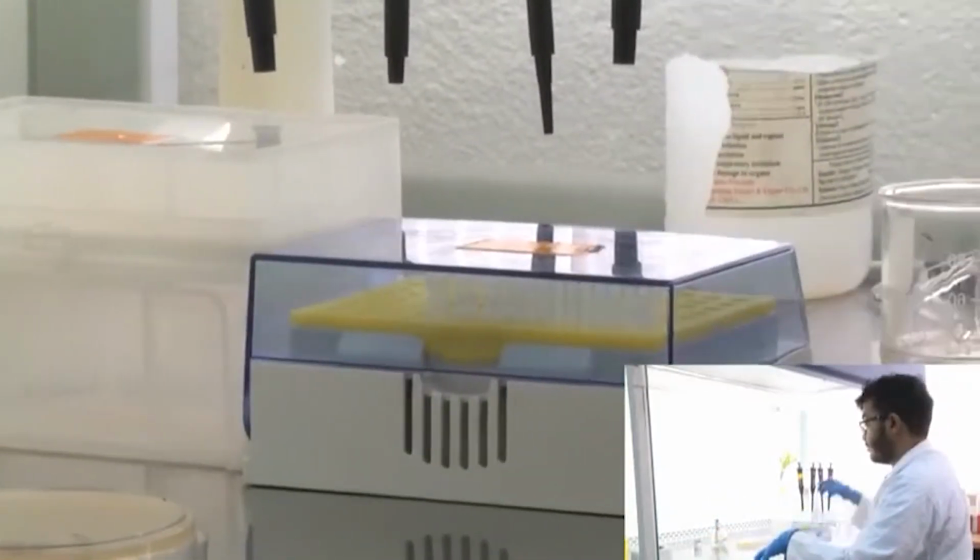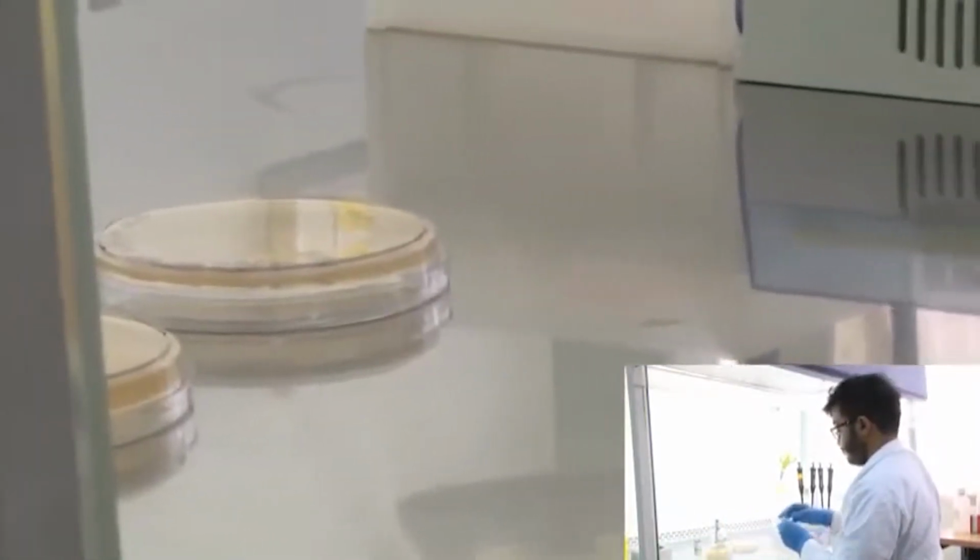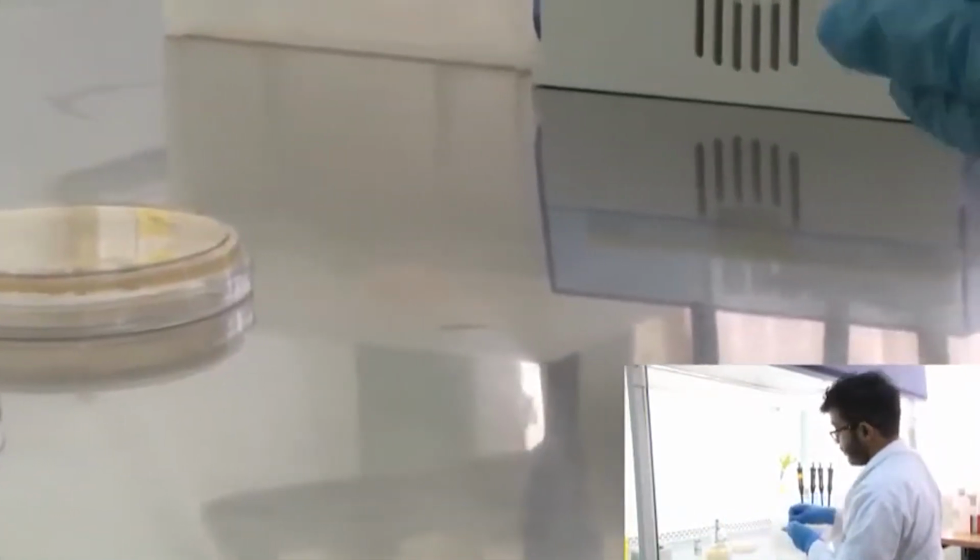Later on, once this experiment is over, I am going to take them and store them in the 4 degrees centigrade fridge. So these 2 plates we are going to use for today's next step of the experiment.